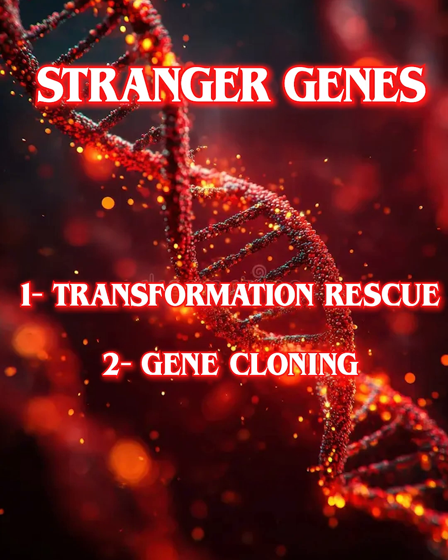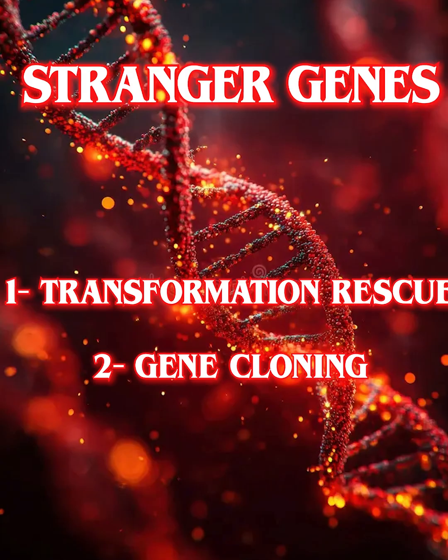Our mission for the entire module is twofold. Number one, identify which septin gene is mutated using a transformation rescue assay in yeast. And number two, clone and sequence the mutant allele using recombinant DNA methods to understand the exact DNA change.